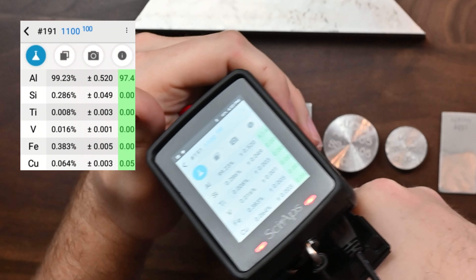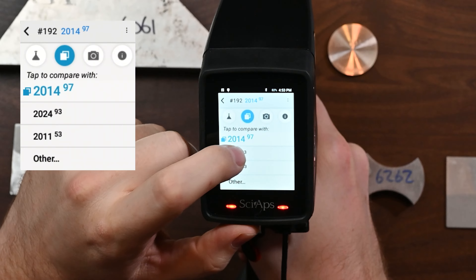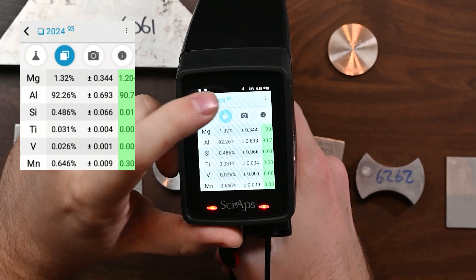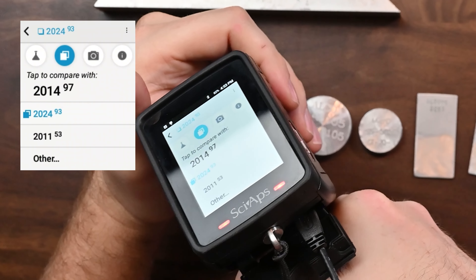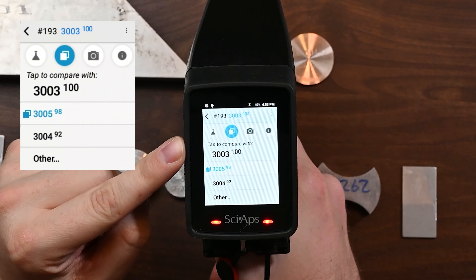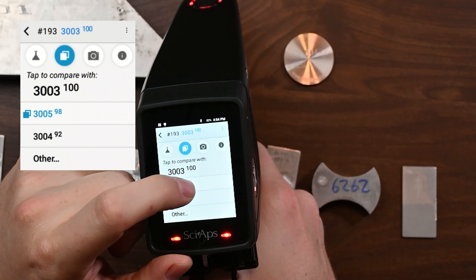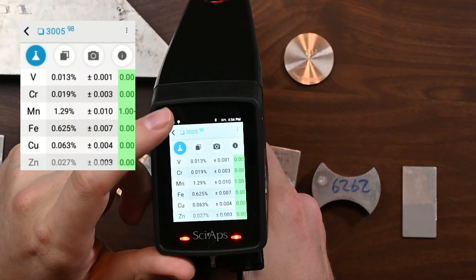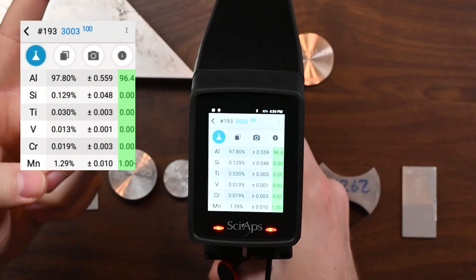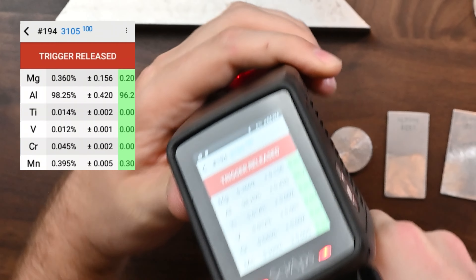How about that 1100 — remember last time we got this one wrong and said it was 6063 with the heavy beam? We nailed 1100 the first time. How about something like 2024 aluminum? This alloy can sometimes be a multiple match — I've got a match to two different alloys, but we're still a really high match for 2024 aluminum. That little tab lets me compare with other chemical results. How about 3003 aluminum? Really easy to see. Now 3003 has two sister alloys — 3004 and 3005. You can see how close we are to 3004 and 3005. What we're looking for is magnesium in these alloys, and that's what we don't see, which is why the analyzer says it's 3003 — we're looking for a magnesium content variation that would put this in the ranges for those other alloys.